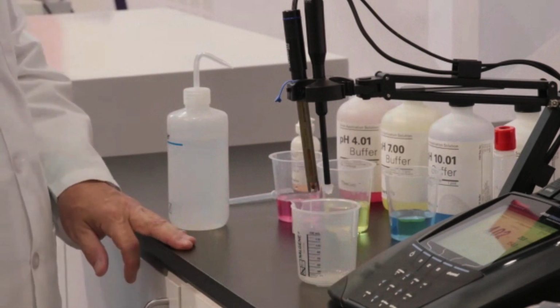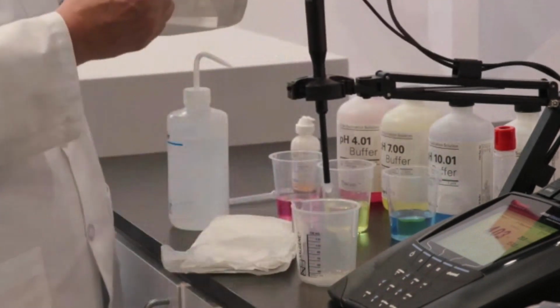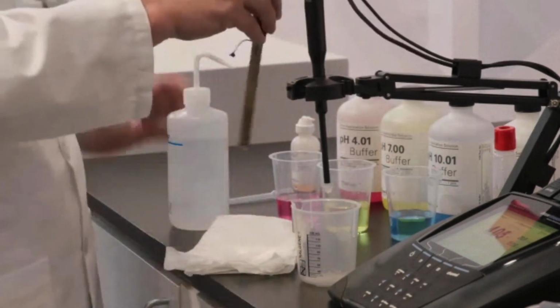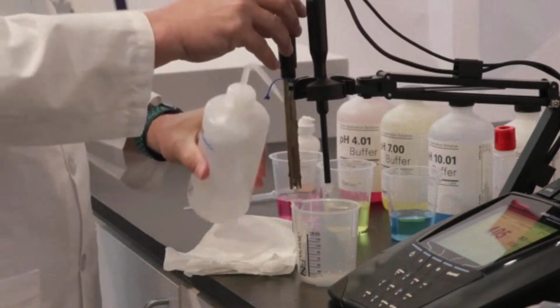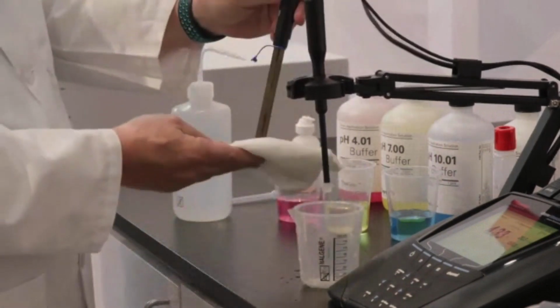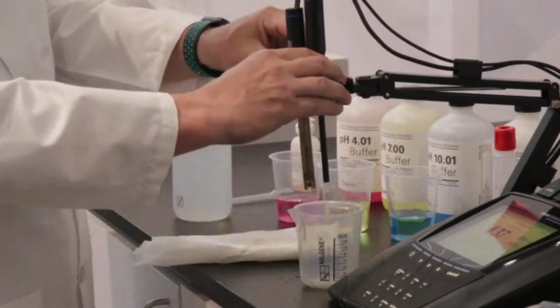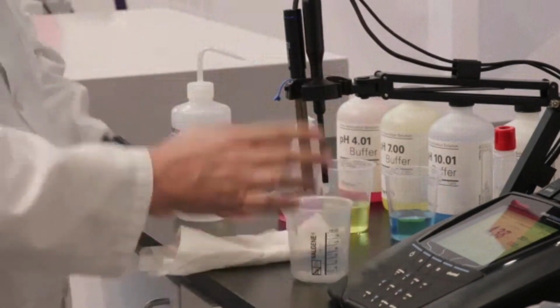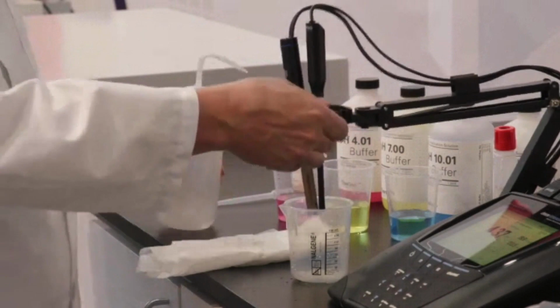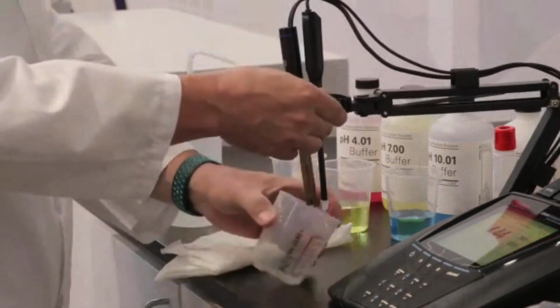Steve can examine the pH electrode, make sure that the bulb isn't cracked or chipped, that there's no crust or coating, and that it's not discolored. The junction should be present, intact. There shouldn't be any crusting or blockage or discoloration of the junction. And the fill solution chamber should have fill solution in it. Shouldn't be dried out. There should be no crystals, mold, or particles inside.